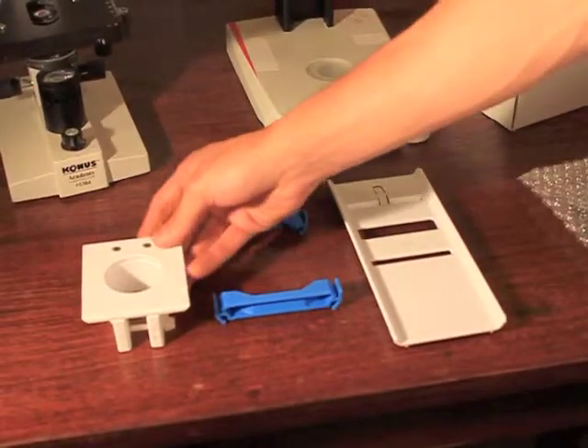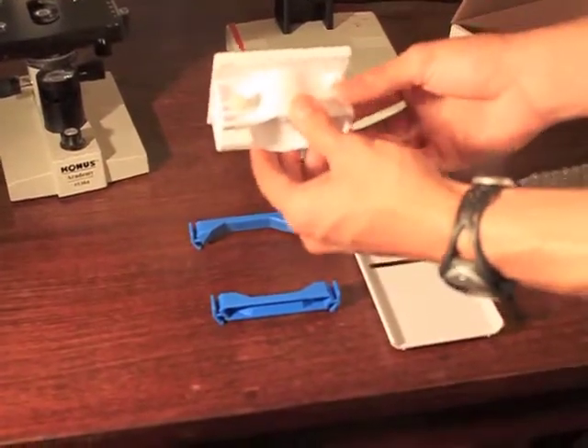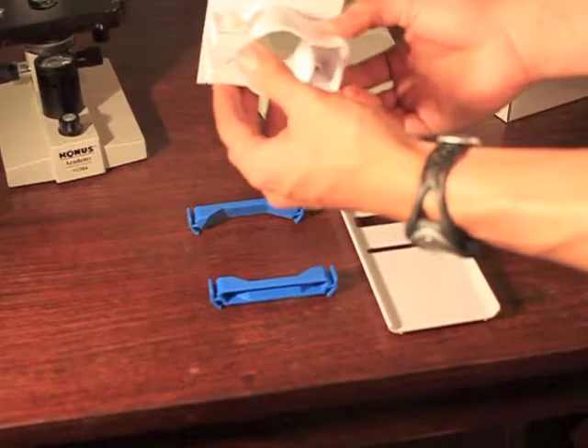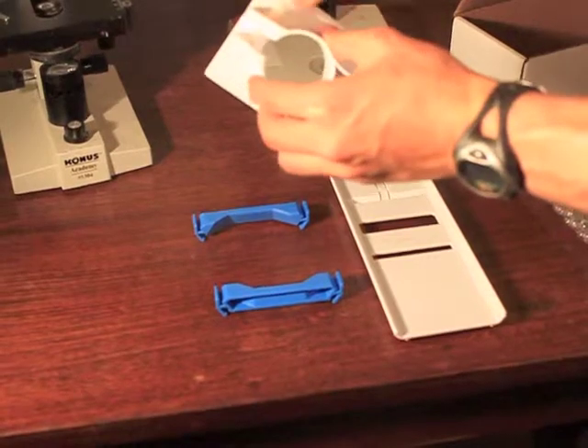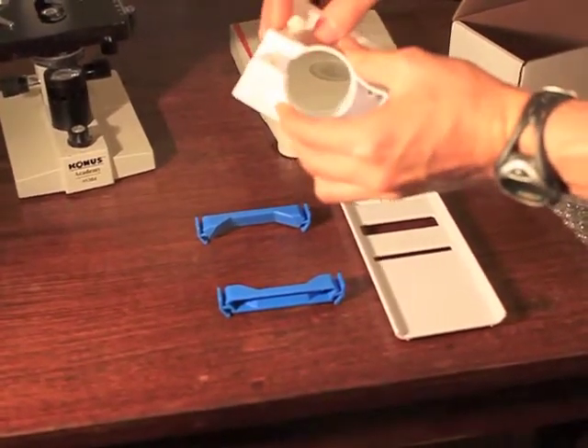The Skylight comes with three different components. The first one is the base, and the base is what's going to clamp onto the eyepiece of the microscope. It does so by turning this screw — you can tighten and loosen the base onto the eyepiece.